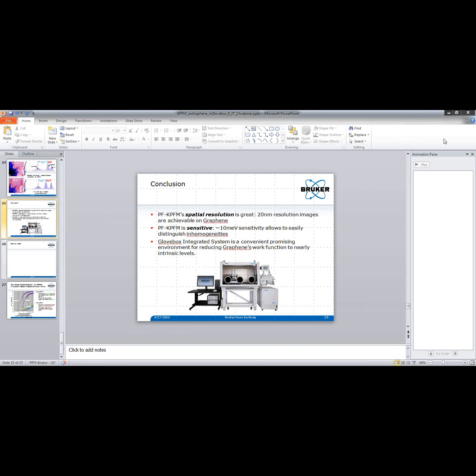You can attach molecules to it, or you can dope it electronically by applying a bias to the graphene. We're not really talking about substitutional doping where we're actually putting other atoms in, like nitrogen-doped graphene. We're only talking about charge transfer doping by things that are in contact with the graphene.